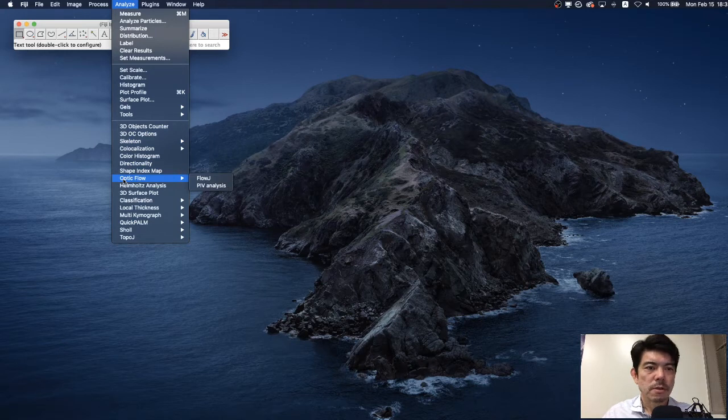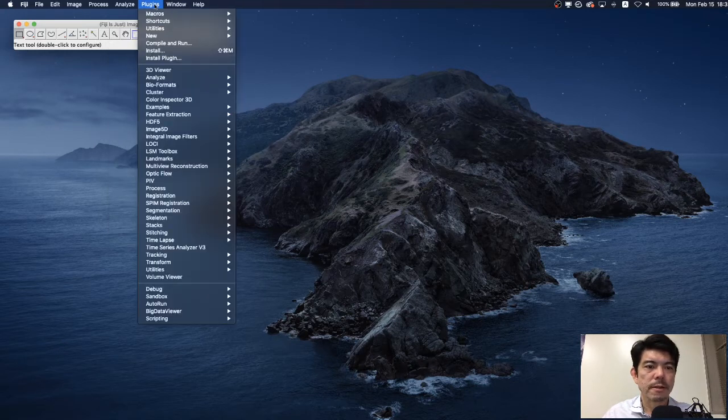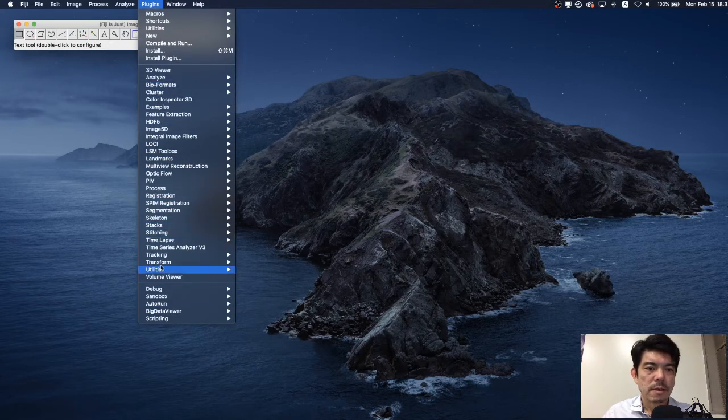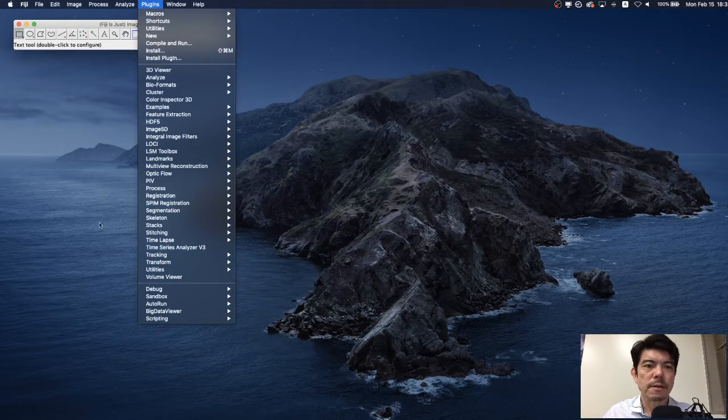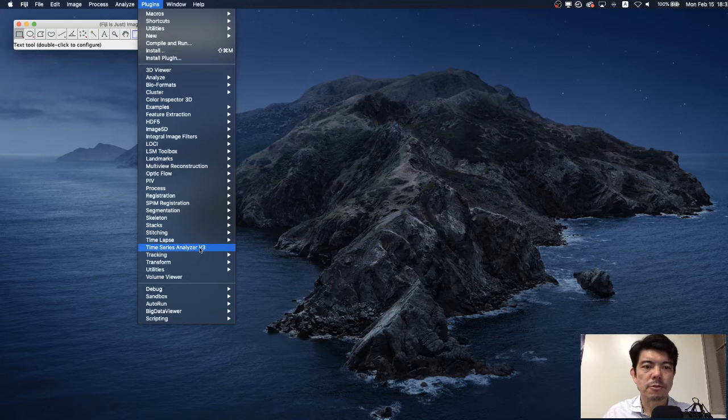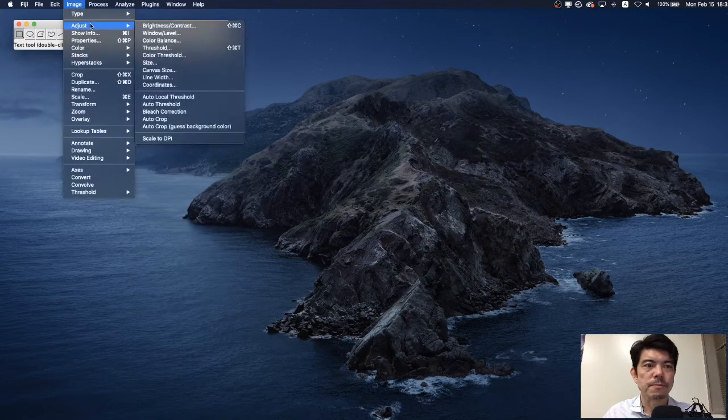Here we have plugin and you should find the Time Series Analyzer V3 here. Now we are ready to use this plugin.